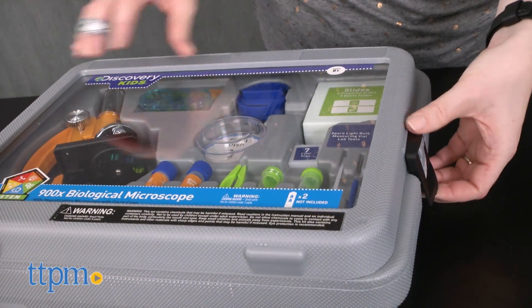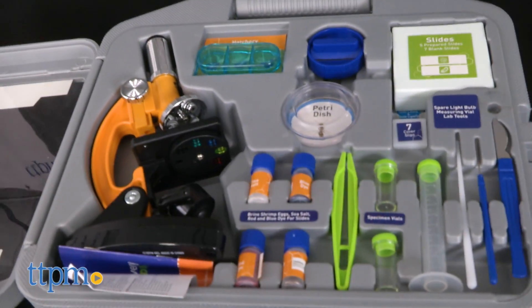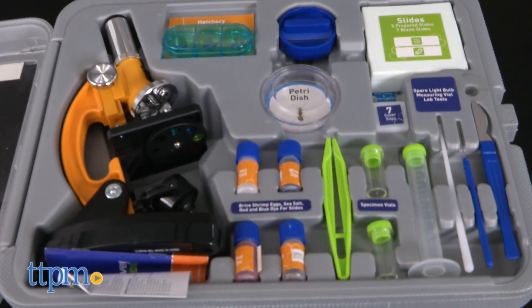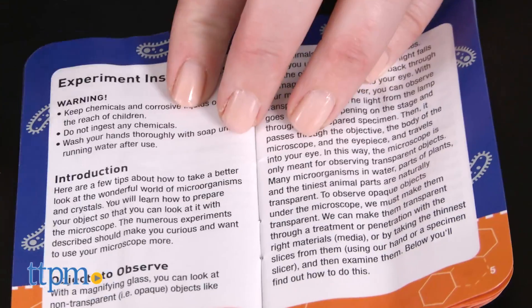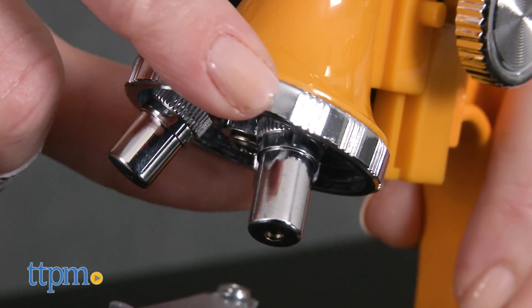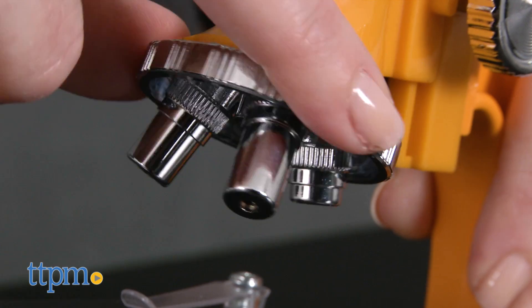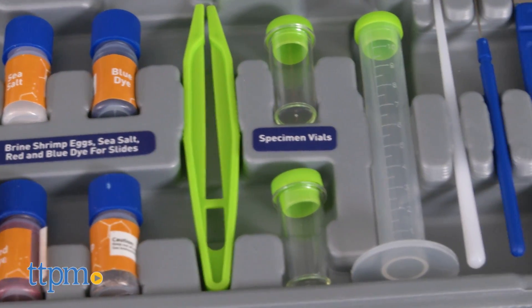This is a complete set that comes with a microscope inside a carrying case, plus lots of other tools for making amazing discoveries. Perform the nine experiments in the experiment booklet using the set's more than 45 pieces, including the microscope that has three magnification powers ranging from 100x to 900x. You'll need two AA batteries for the microscope, which are not included.